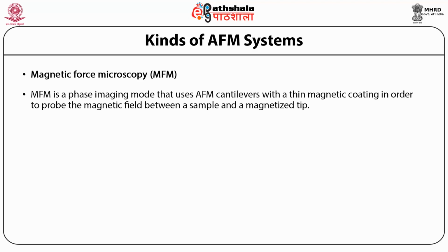The MFM is a phase imaging mode that uses AFM cantilevers with a thin magnetic coating in order to probe the magnetic field between a sample and a magnetized tip. This method is commonly used to image any materials with heterogeneous magnetic properties, such as magnetic based hard drives.